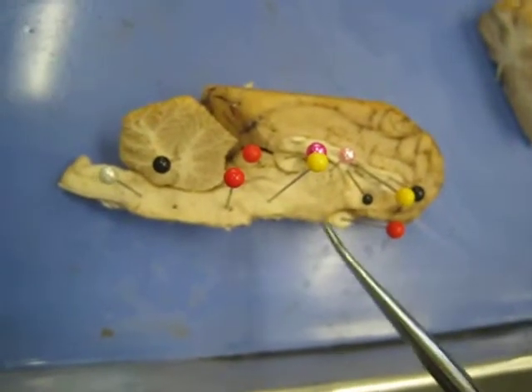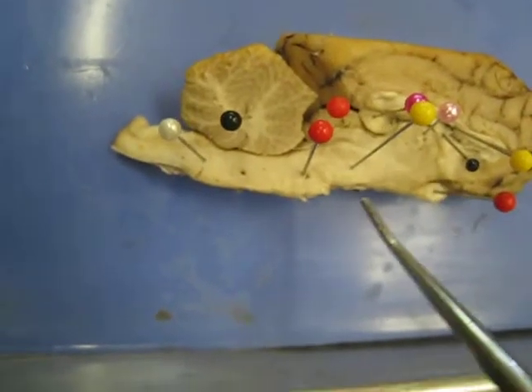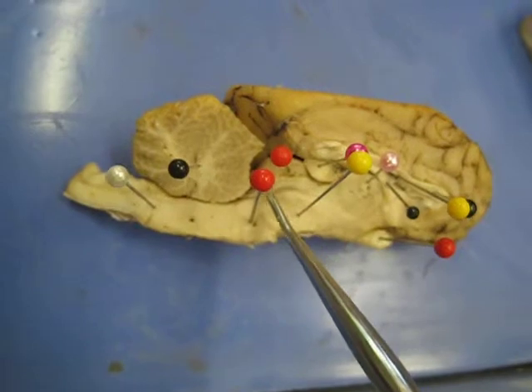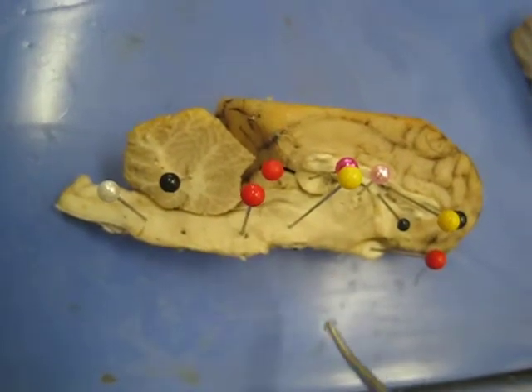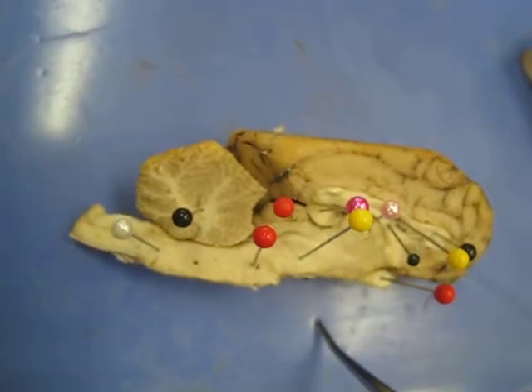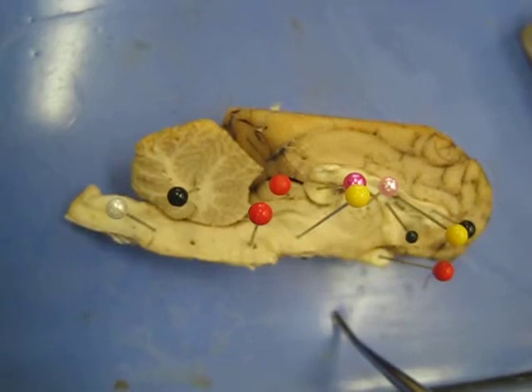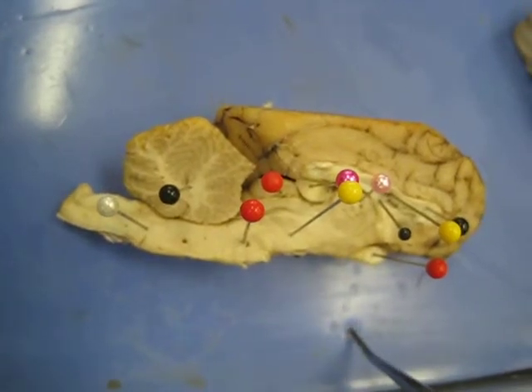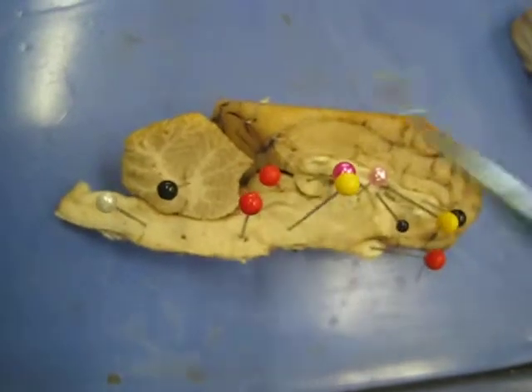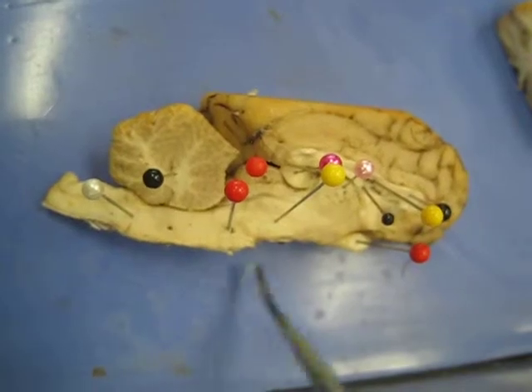Okay. This bright pink pin, what is that? Pineal gland. And then what's this red one? The corpora quadrigemina. What makes up the corpora quadrigemina? Four something. Superior and inferior. That's right. So there's 2 superior colliculi and 2 inferior colliculi. Superior is for vision. Inferior is for hearing. So this is your cerebrum. This is your cerebellum. What's the white stuff? Arbor vitae. And that's it for this.